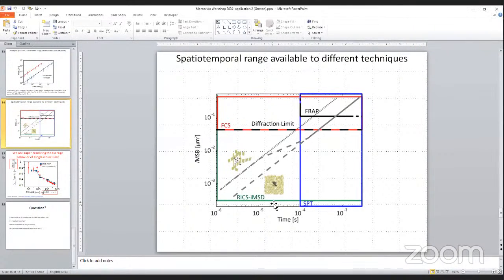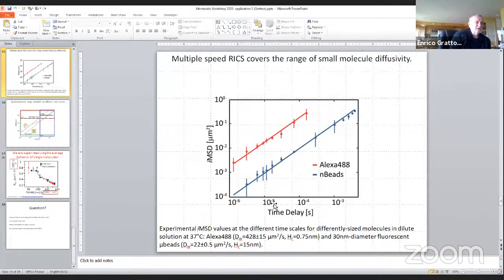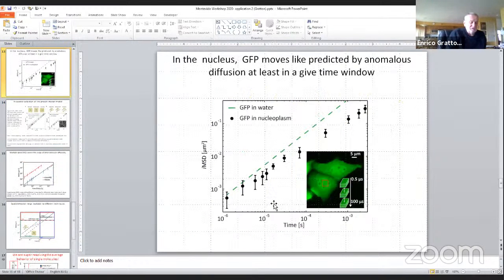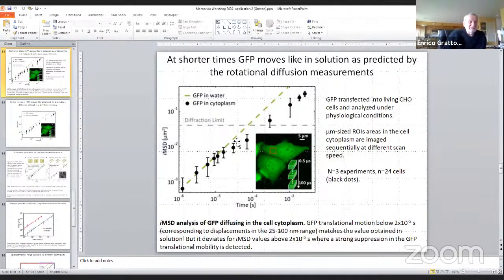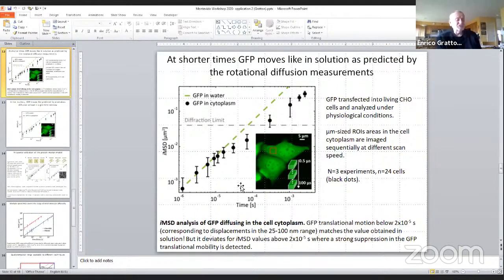Wednesday, Lorenzo will talk about this correlation within the nano camera. With the nano camera, which is essentially the same idea, but instead of being a line, you have a surface. Can I ask the last question? Did you try this line scan in the plasma membrane with dyes? Yeah. What do you mean? I show, well, maybe. So this is in the cytoplasm. At the plasma membrane. In the nucleus, never goes. No, at the plasma membrane. If you have lipophilic dyes to see, let's say, probably you can label with fluorescent cholera toxin. Yes, I know that.